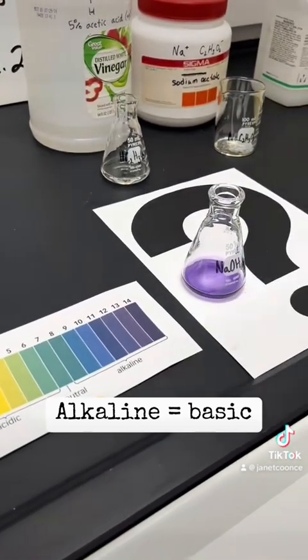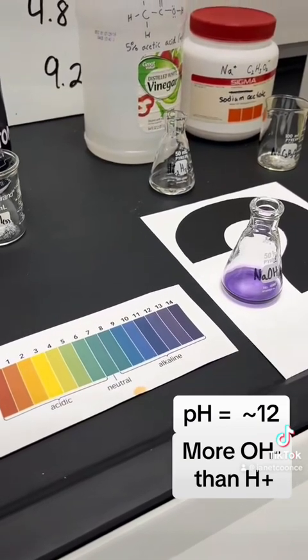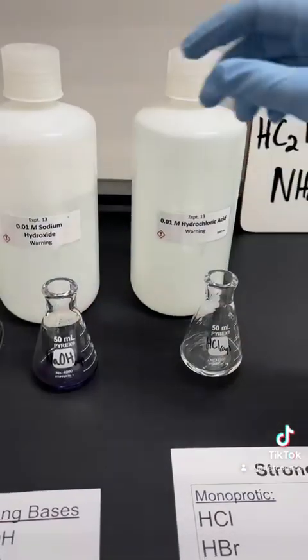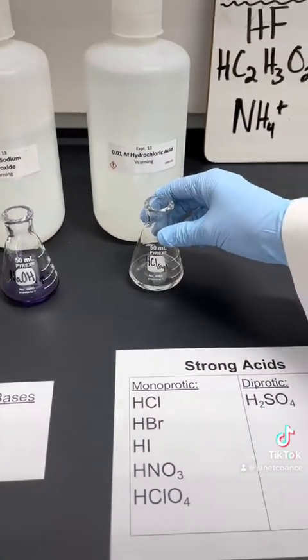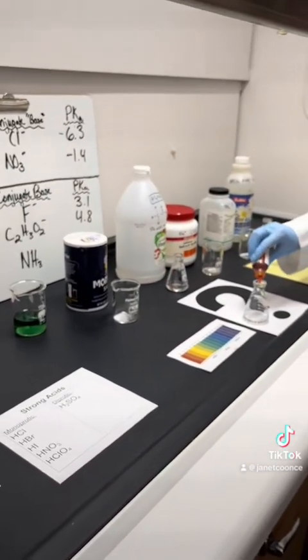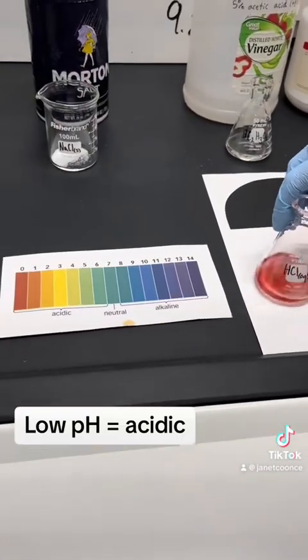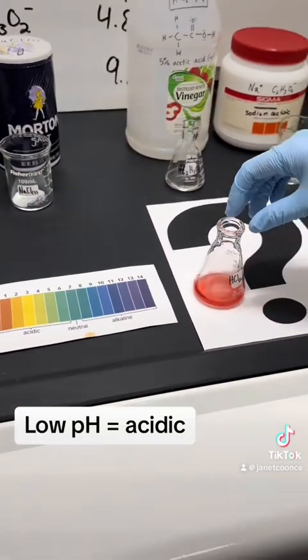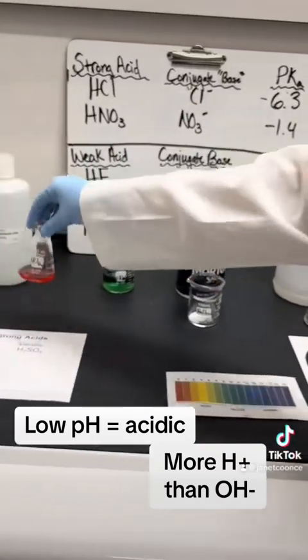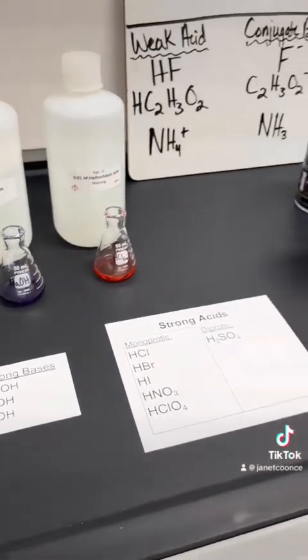So we see that it's a purple color, so there are more OH ions that are creating this purple color, this alkaline. Very cool. So now let's see what happens when we put our universal indicator in with a strong acid, hydrochloric acid. So hydrochloric acid with universal indicator, and we see bright red. Right, so very low pH, meaning what? That we have more H plus ions that are creating this low pH level. Right, so hydrochloric acid, very acidic, sodium hydroxide, very basic.